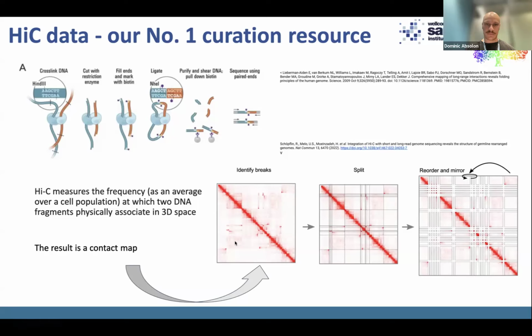So you can imagine that this frequency data of one-to-one matching between chunks of DNA can, scaled up, result in a heat map when they're plotted against each other, and that's why we have down the diagonal a really high intensity of signal, and then on the off diagonal we have varying levels of the signal. And this is indicating that, by the way, can people see my mouse? Yes, cool.